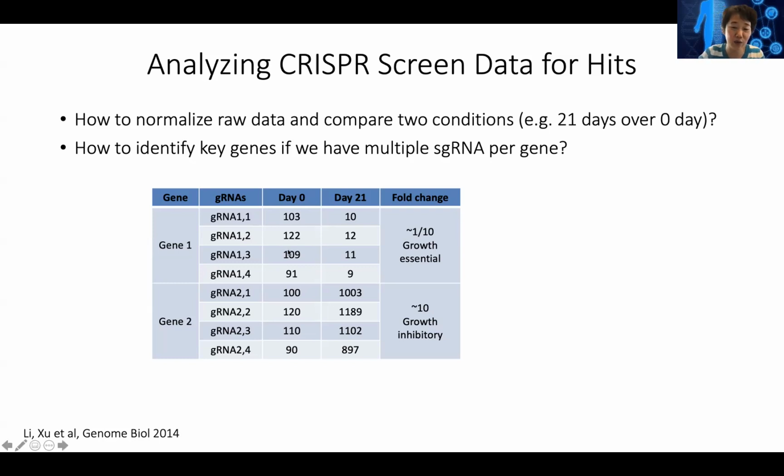And so in this situation, the vast majority of the genes will not have a change. So you can use those to normalize to make sure the 2 libraries are more comparable. There will be some genes, usually like 20, 30%, or maybe 10% of the genes, that will make the cell grow slower, but very few genes. We're talking about a few hundred genes where, if you knock out the gene, the cell will grow faster. It's a much rarer event.